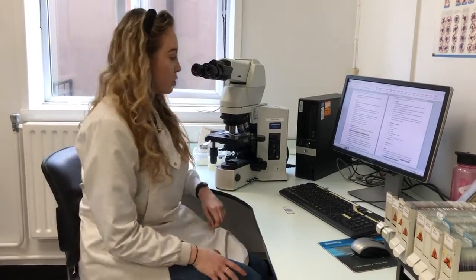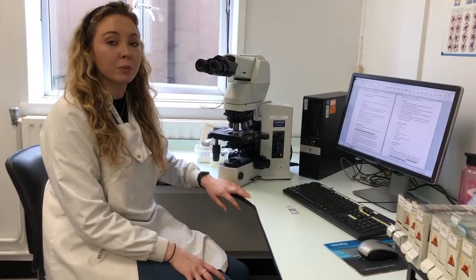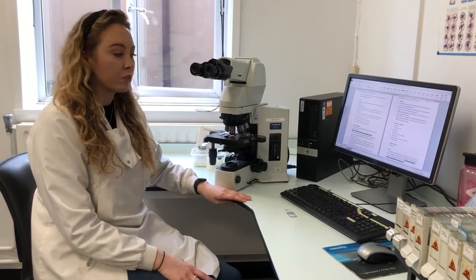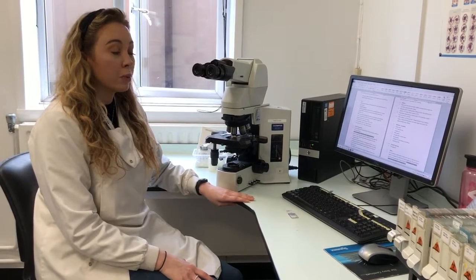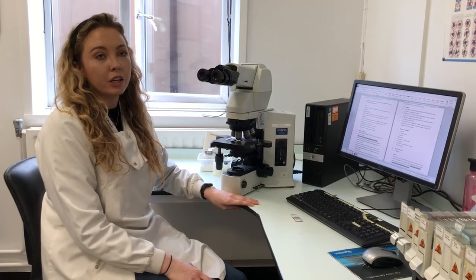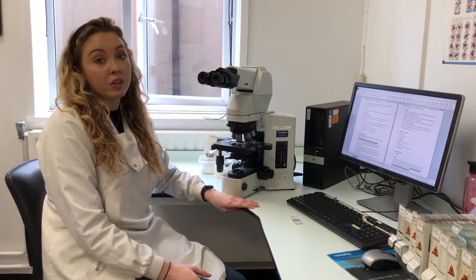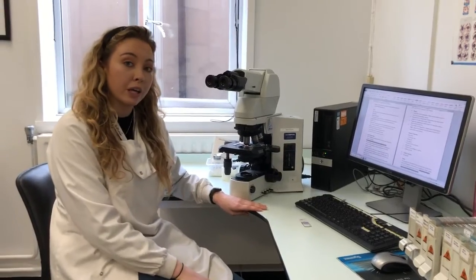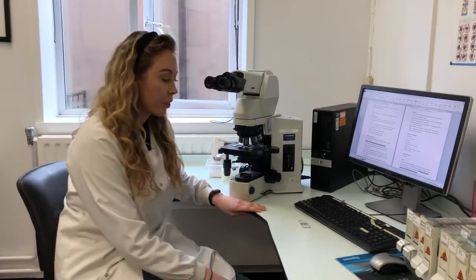And today we're just going to show you the main parts of the compound microscope that we use every day to review blood films. We look at blood films to make sure that the blood cells are normal, and if they're not, we need to investigate further. They could be abnormal for numerous reasons and they can be linked to a number of different diseases. So it's very important that we notice what's abnormal.